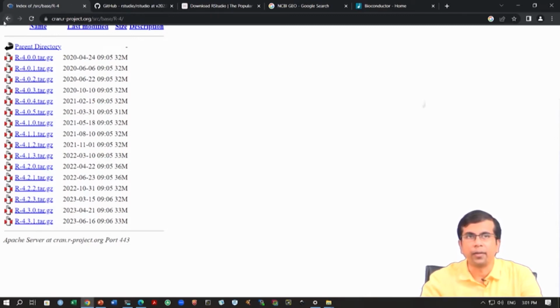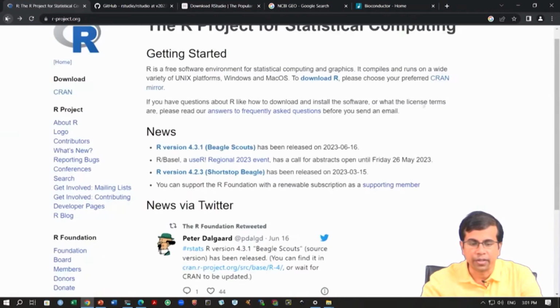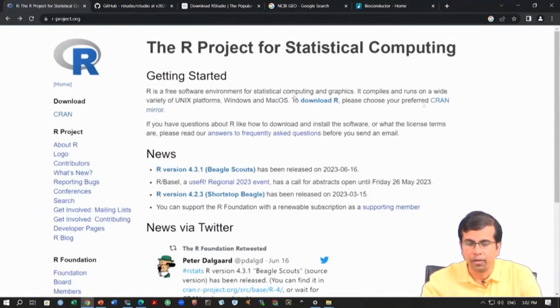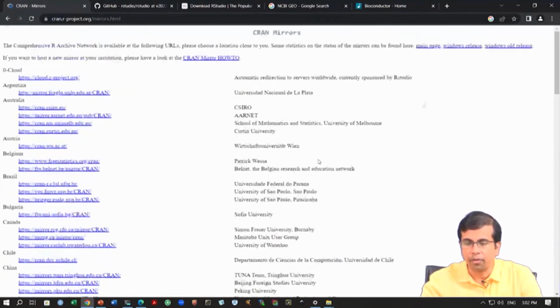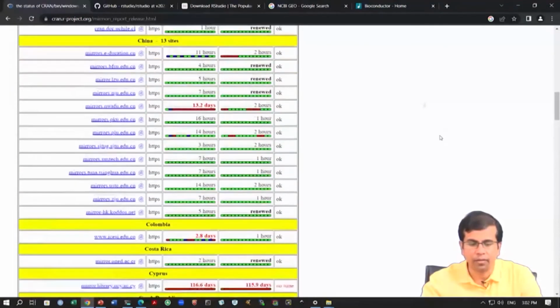So, let us look at this. If you want to install, you can download this and install for your system. Again, you can use different options, whether you need a Windows system, for Windows release you can go here and see all these methods.